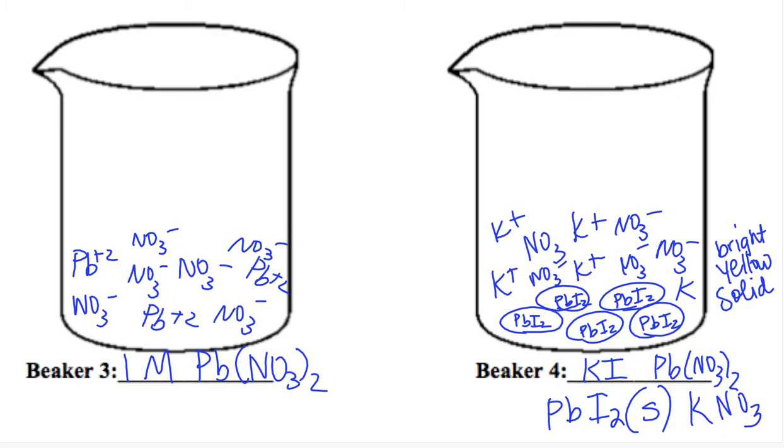So sugar dissolves because it's polar, right? Does it break into ions? No. The only way you can get a current going through this is for things to break into ions, not for things dissolving. It's for the things that dissolve that bust into ions, and sugar does not dissociate. So you can see here, it is not conducting any electricity.